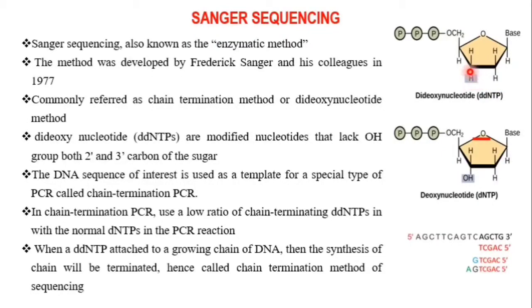What is the problem with that? If there is no hydroxyl group in the third position, then when we are adding nucleotides into the PCR reaction mixture, and this dideoxynucleotide is attached into the growing chain of DNA, the 3' OH is not present in this dideoxynucleotide.